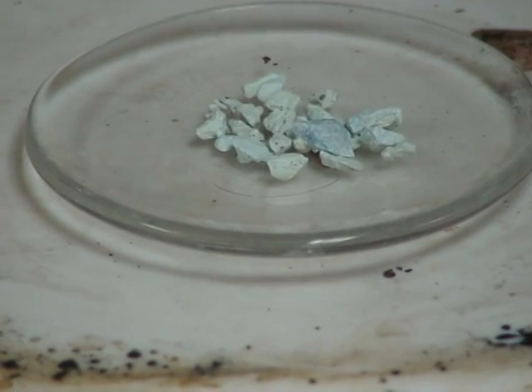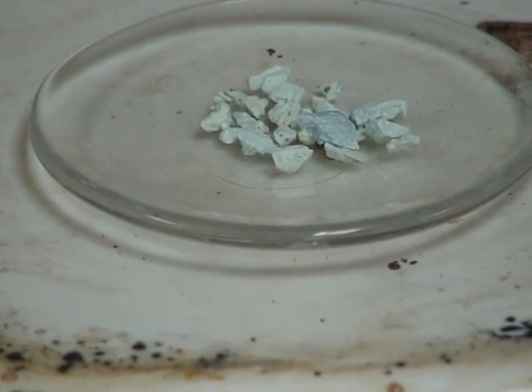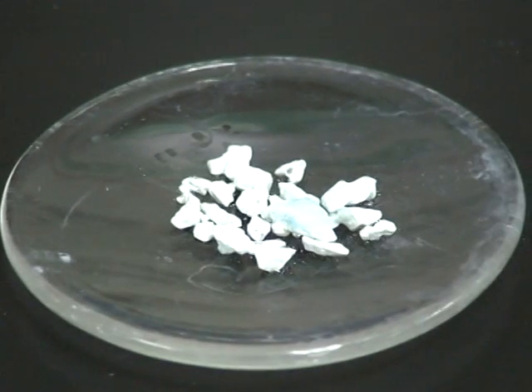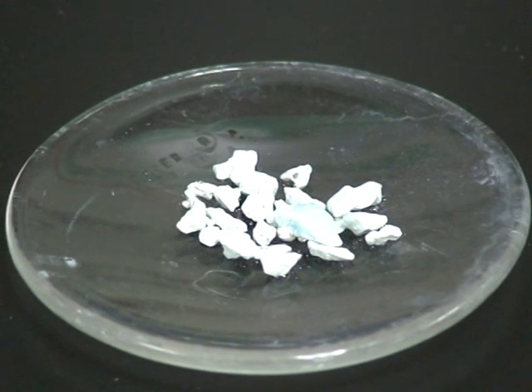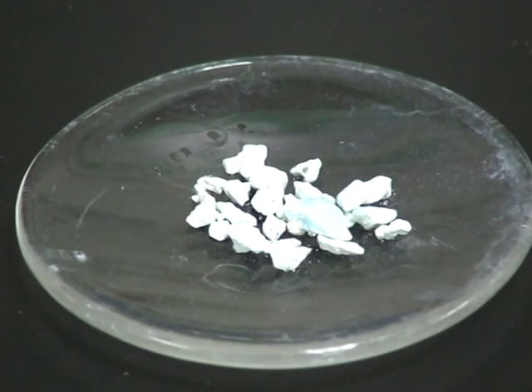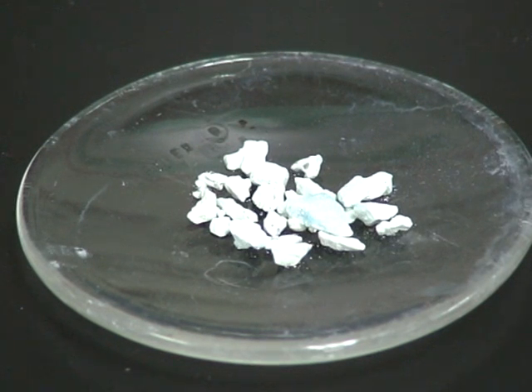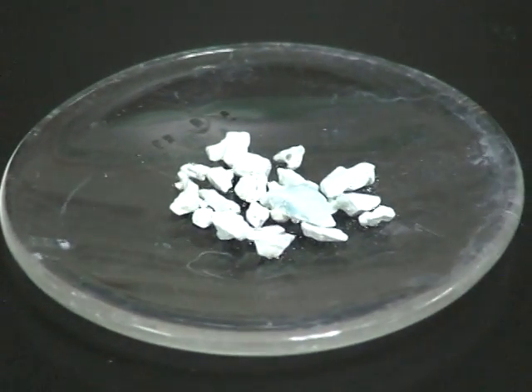We're going to go back to our old friend, the copper crystals. Okay, we're back to our old friend, the copper sulfate crystals, which turned white. And the question is, is that a chemical or physical change? So we've seen a couple things where color change has been involved. And let's take a look. There's only one way to really find this out. I want you to watch.